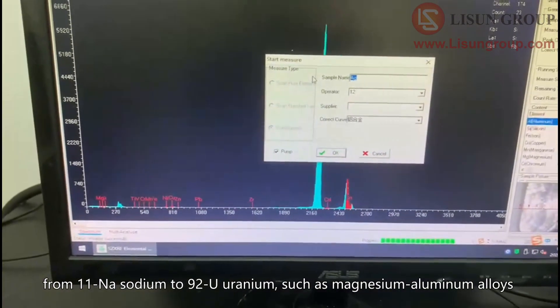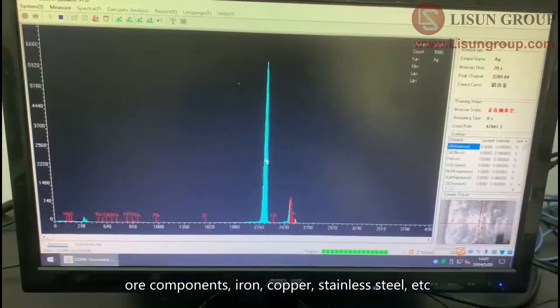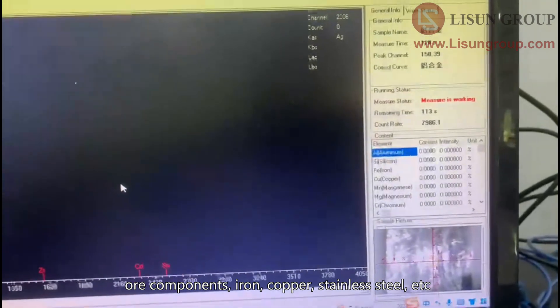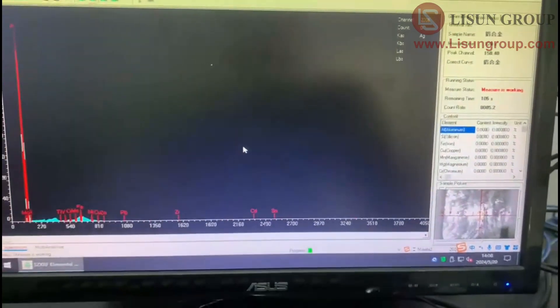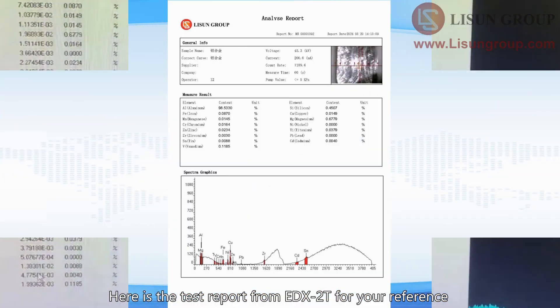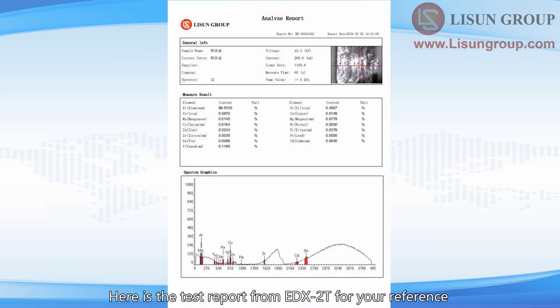This includes magnesium-aluminum alloys, or components such as iron, copper, stainless steel, etc. Here is the test report from the EDX2T for your reference.